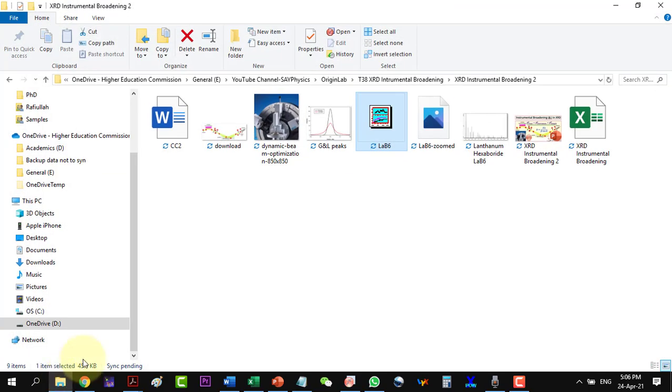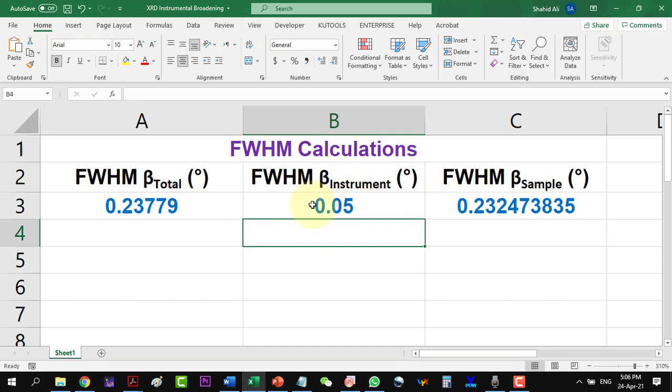Let's open the Excel template for calculations. This is the FWHM calculated from the sample. Here we will have to paste the FWHM value of the standard.